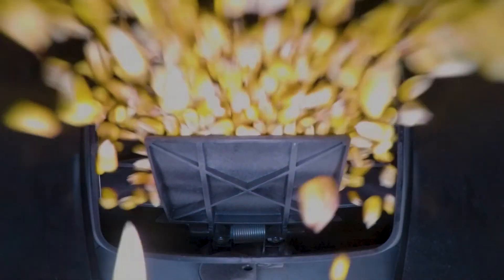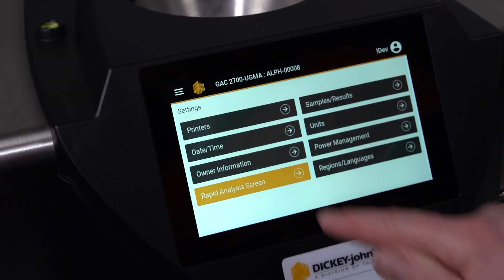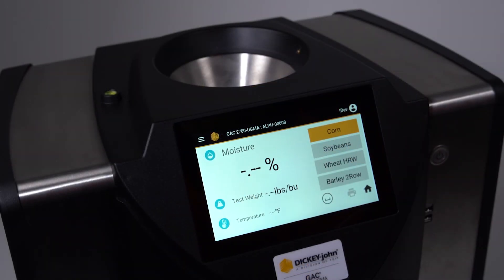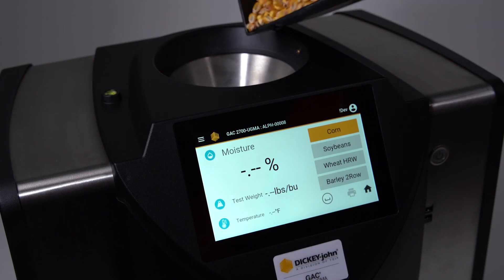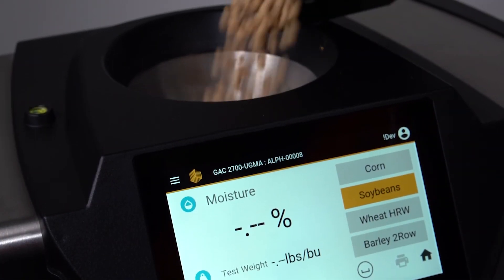This is key to getting samples accurately measured as quickly as possible so the grain operation can function efficiently. Our new rapid analysis mode provides a faster processing time as operators only have to press one button on the screen to select between favorite grains when receiving different grain types during the busy harvest season.